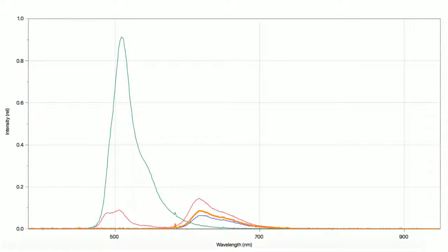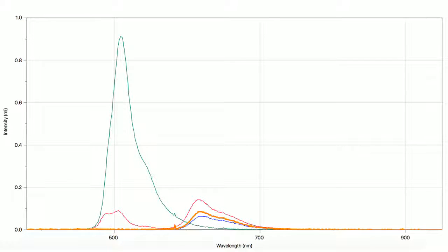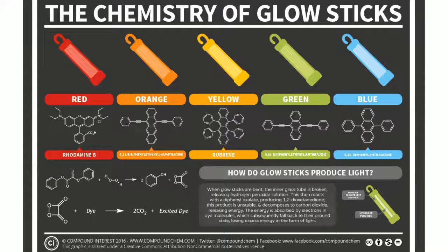Emission intensity does depend on the properties of the fluorescent dye. This can be observed in the first experiment where the peaks of the green and red fluorescent dyes were shown to have different intensities. The reason that the red has a lower intensity than green is because red is comprised of larger molecules and thus has more electronic states because its molecule has more electrons, meaning that the electrons, once they are excited, have to transition through more states before they can reach their emission event, demonstrating that, on average, it takes longer for a red molecule to emit a photon than it takes for a green molecule to emit a photon. So therefore, green has a higher intensity than red because green emits more photons per unit of time.